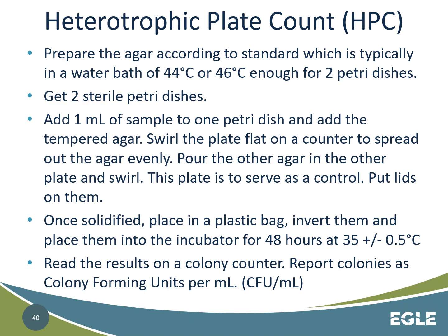Then you're going to place the lid back on the plates, and you're going to let it solidify. Once the agar has solidified, you're going to invert them, both of them, place them in a plastic bag, and then place them in the standard bacteria incubator, which is 35 plus or minus 0.5 degrees Celsius for 48 hours. And then the readings are going to be taken at 48 hours.